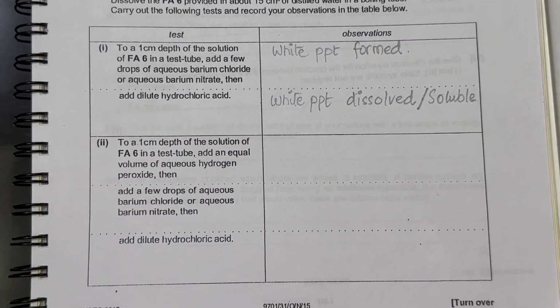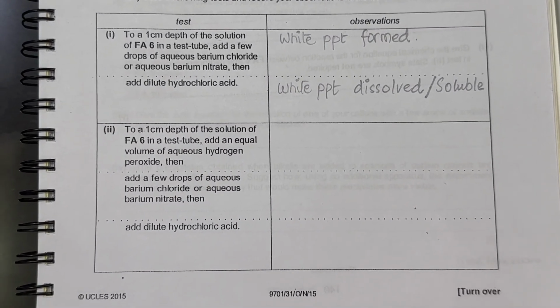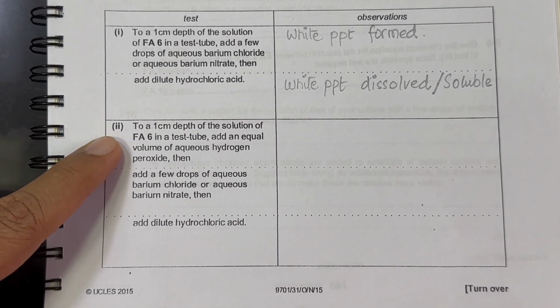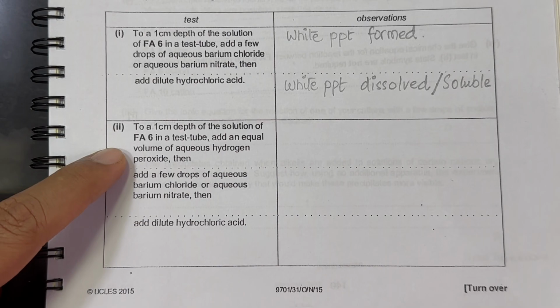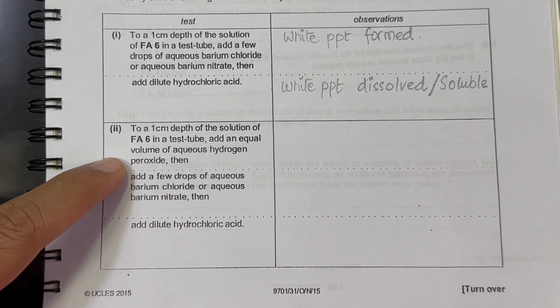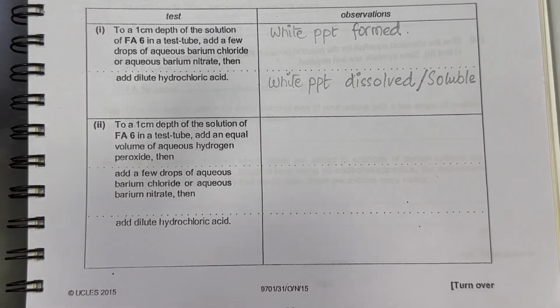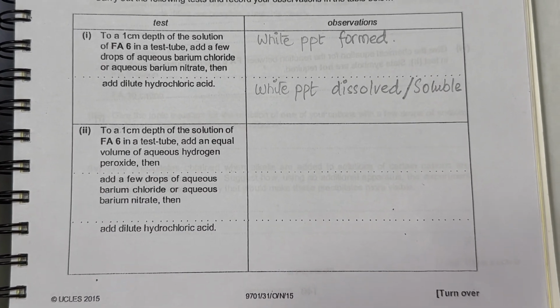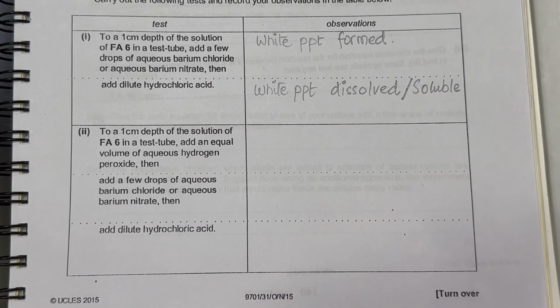Now, let's move on to the next part of this question, which says to a 1 cm depth of the solution of Fa6 in a test tube, add an equal volume of hydrogen peroxide, which is an oxidizing agent, and of course it will oxidize the sulfite in the given compound.